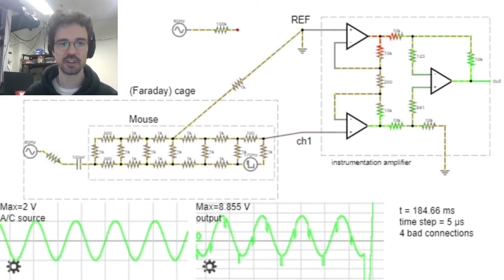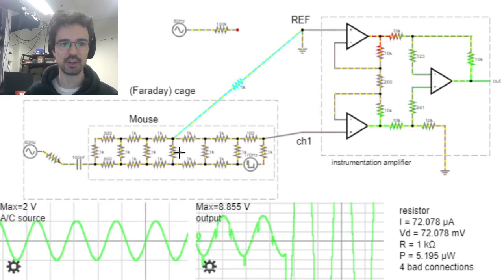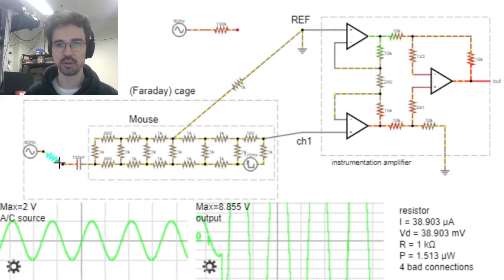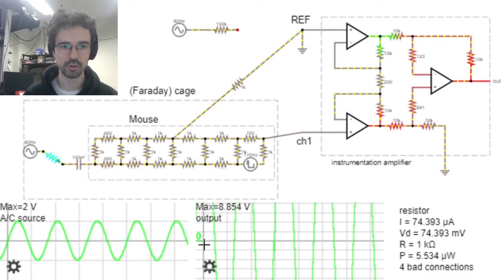And you can see the situation became much worse, because now the impedance of the ground screw has gotten high enough that it cannot force the animal to ground level, and instead the animal is being pushed up and down by the environmental noise. This could happen just because the cable is long. This could happen because your ground screw is not good. This could happen because your ground screw is too far away from where you're doing your recording.